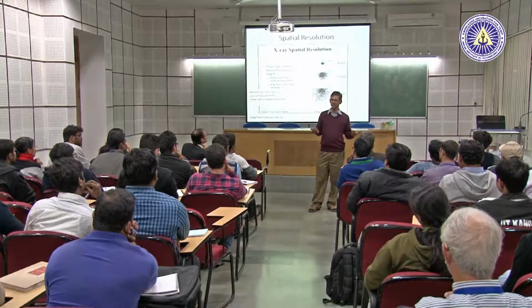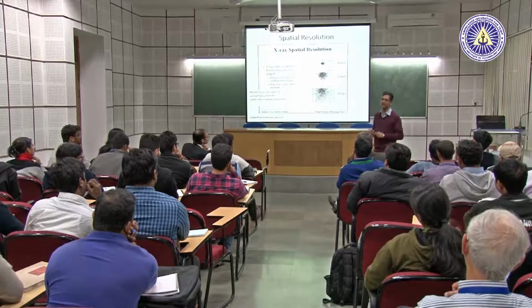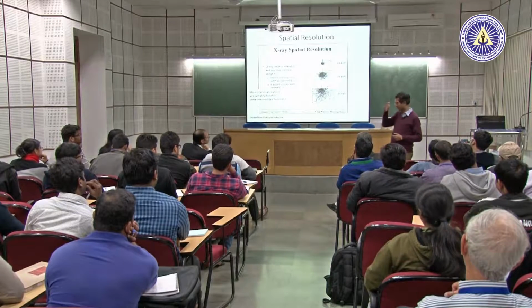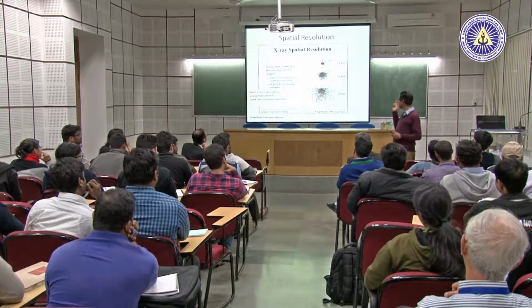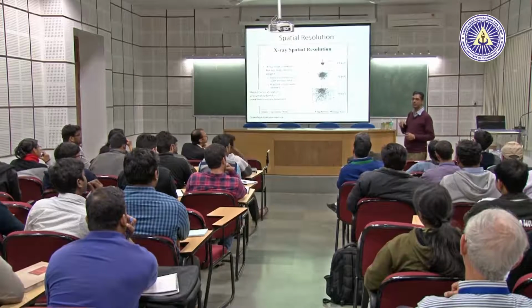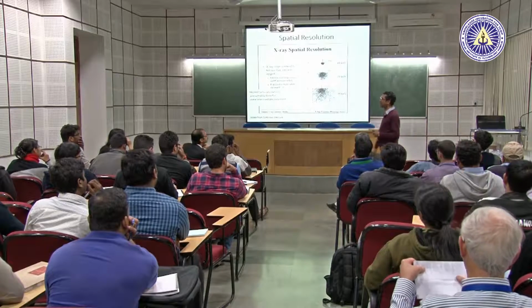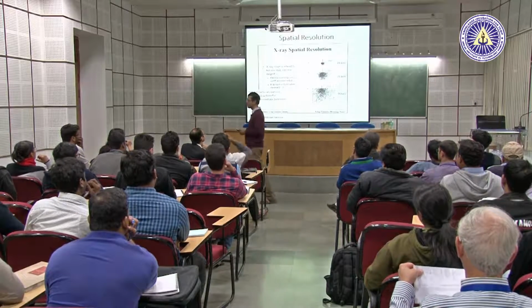The third one is fluorescence. The first 2 factors are predominantly present in all samples. In older microscopes there was a program running in the computer which would correct these corrections. But even if you do this for carbon and oxygen, you will not get good quantified data.